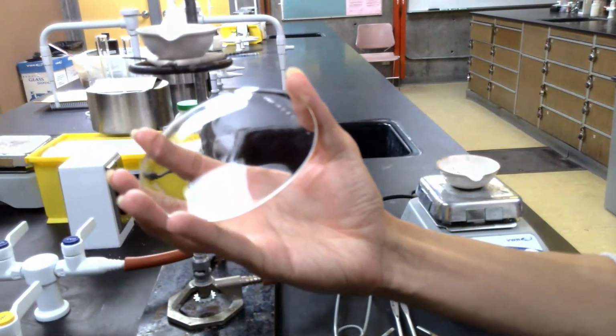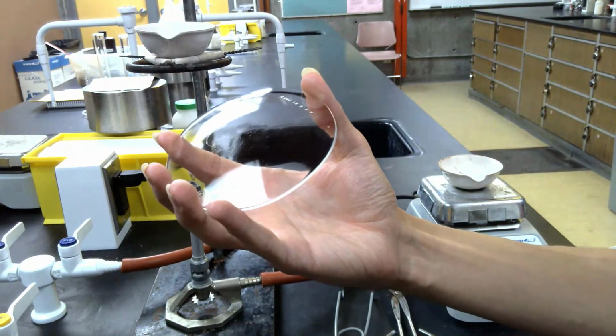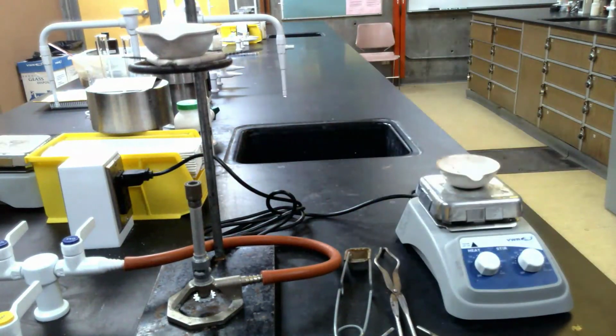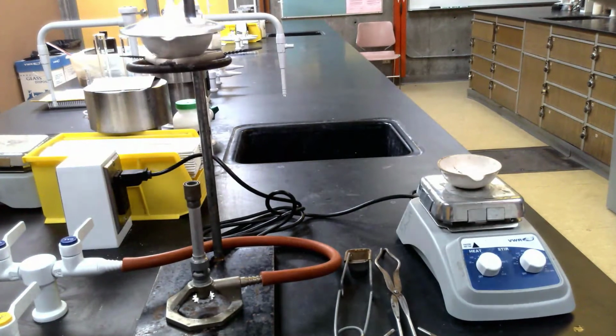Now, with the salt water here, it has a nasty tendency to splatter as it's heated, so I'm going to actually cover my evaporating dish with a watch glass, and that will allow me to avoid any kind of spattering or sample loss that might occur during the heating process. So I'm just going to place it like that, nice and covered, and we're all ready to begin the heating process.